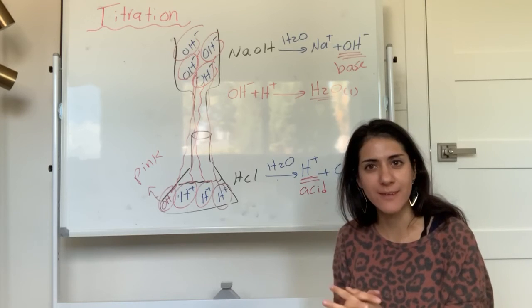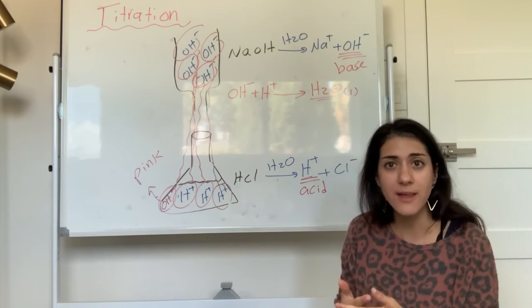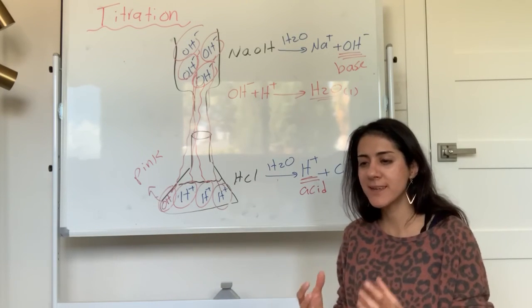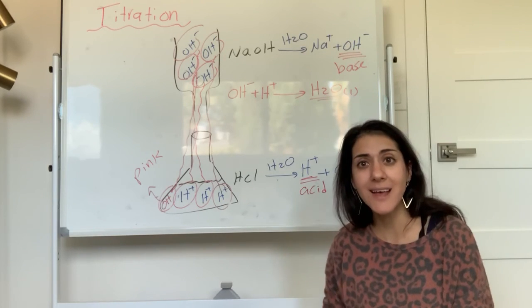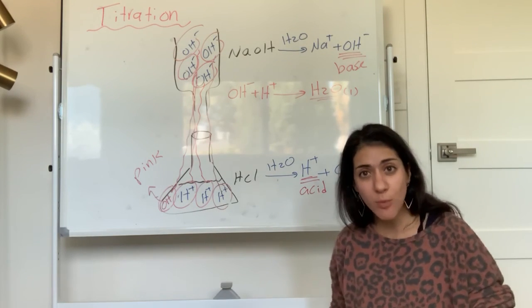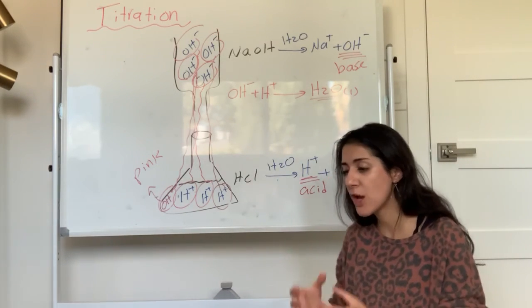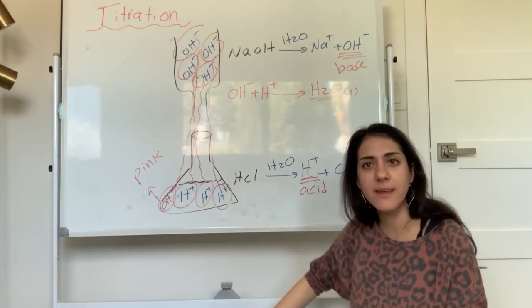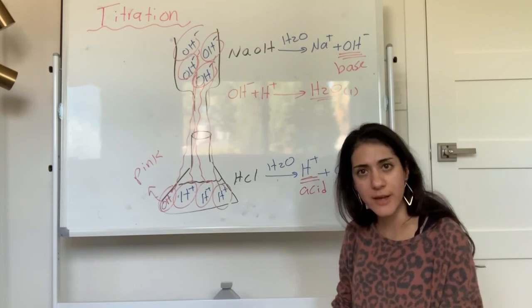Vinegar, that's your salad dressing, right? We actually use a vinegar that we bought from Safeway to do this acid-base titration. What makes vinegar have that sour taste is the acetic acid in the vinegar. So in that lab, you're going to figure out how much acetic acid is in your vinegar sample. So the acid here, the base over there, and you're going to do a titration.